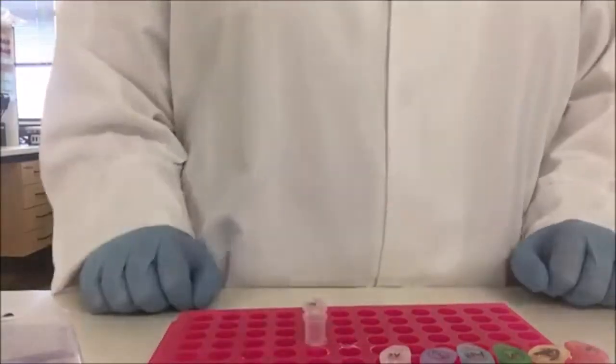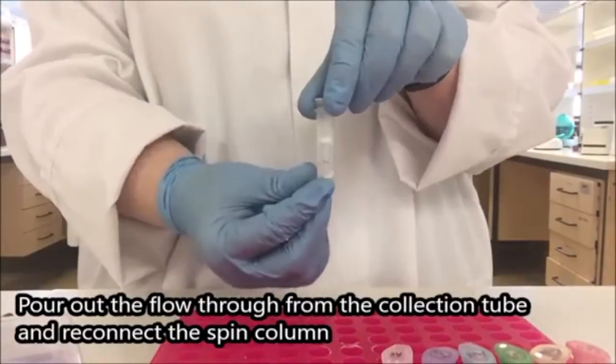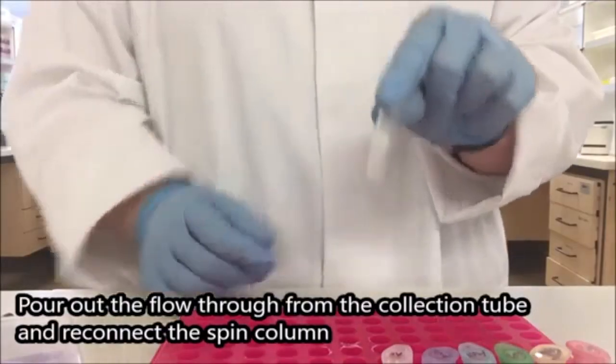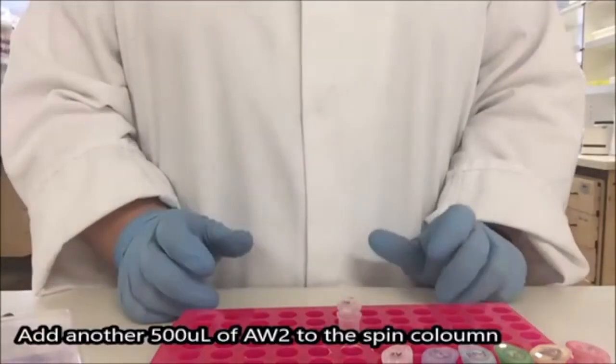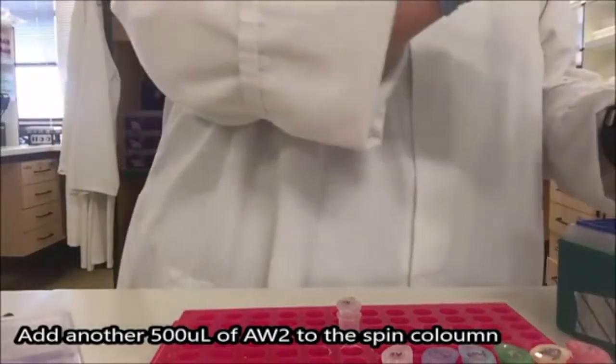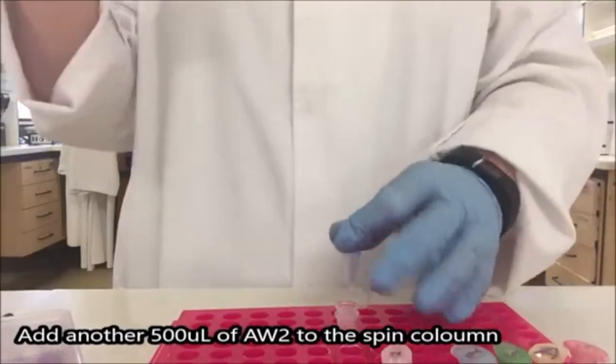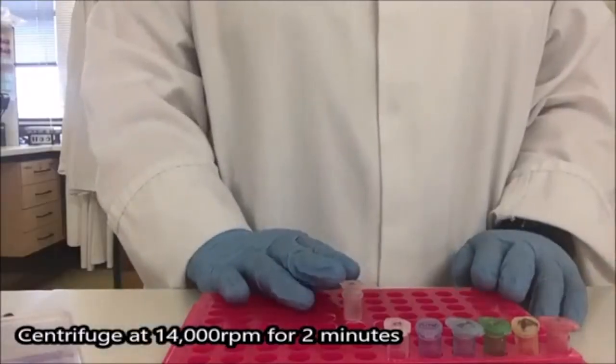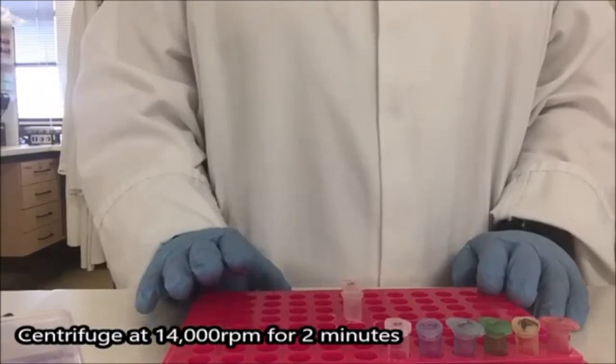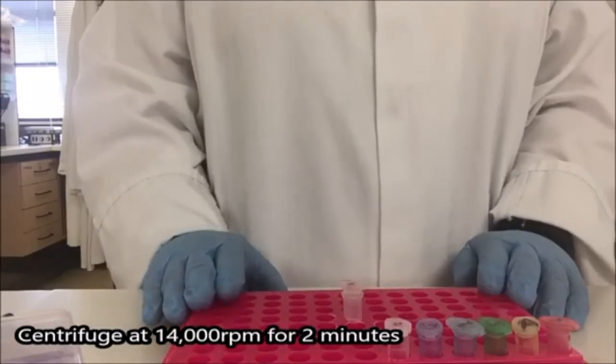I now have that out of the centrifuge. Tip the contents of my collection tube into the waste and connect the top back with the bottom. And I'm going to add a second wash of AW2. Again, 500 mcl. This second wash with AW2, we're going to centrifuge at a higher speed. So we're going to do 14000 rpm for two minutes.